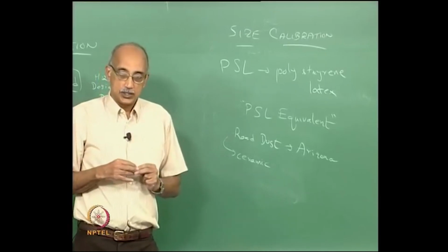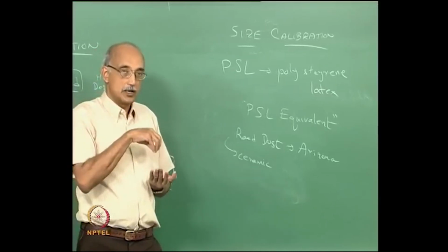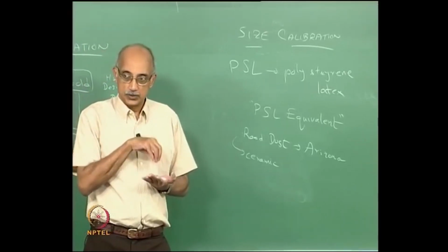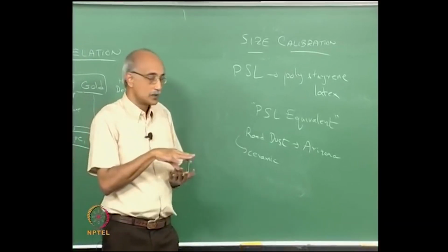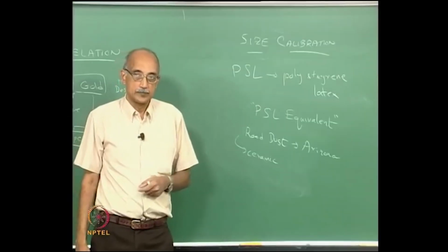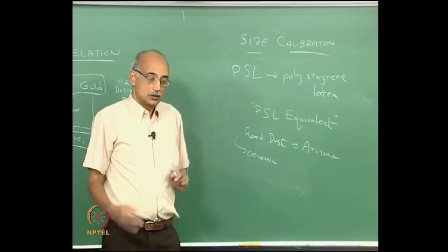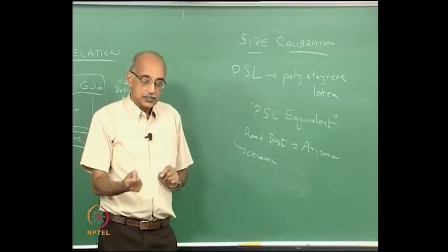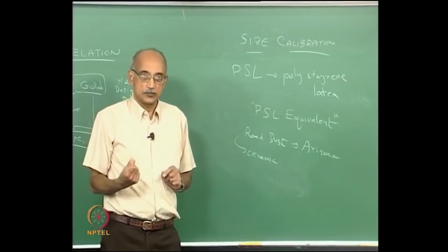So essentially you take a liquid and put a measured number of particles into this liquid, stir it very well, prepare a homogeneous mixture, and now do not only your size analysis but also count analysis, count per unit volume, for example. And you would use that data to then do simultaneously size calibration as well as count or concentration calibration of the instrument.